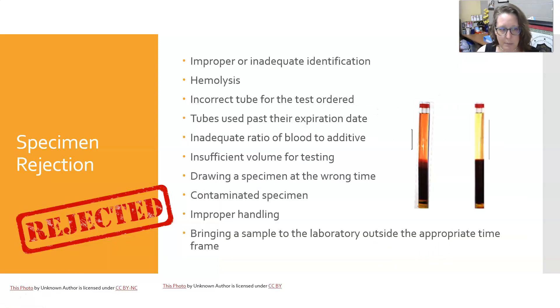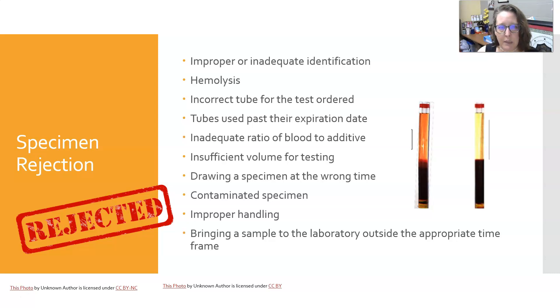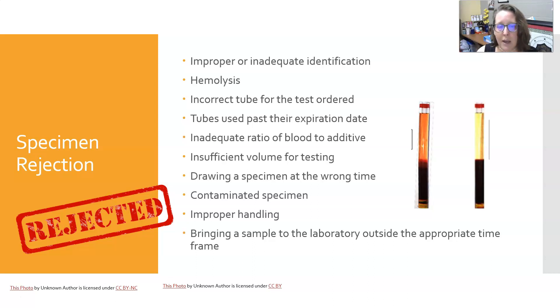Specimen rejections often occur at central processing. Reasons to reject a specimen include: first, improper or inadequate identification. If a tube comes into the lab and is not labeled, even if the nurse knows who it belongs to, you cannot accept it because you cannot be 100% sure whose blood it is.